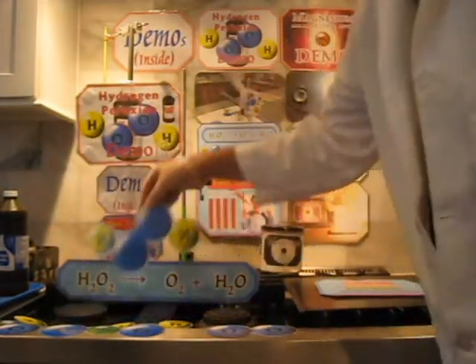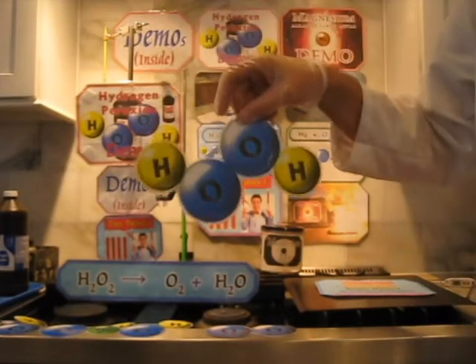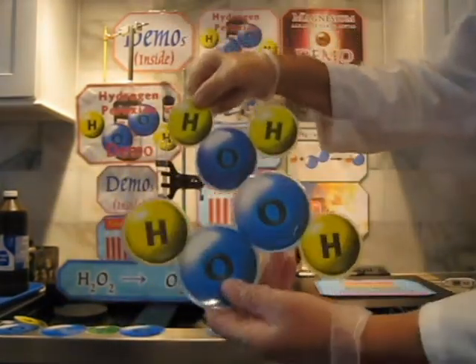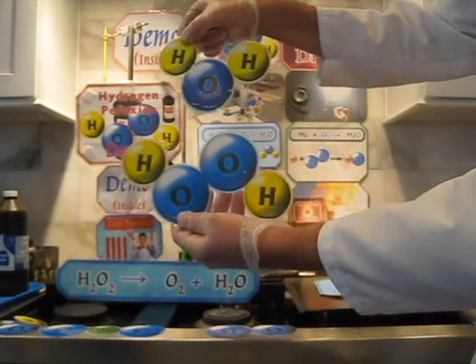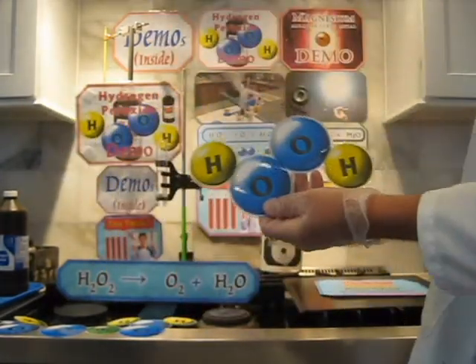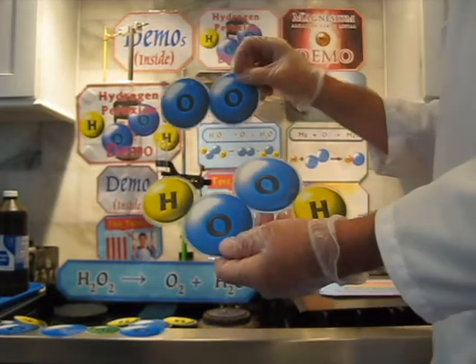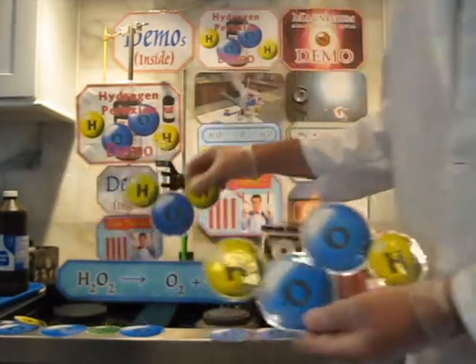Hydrogen peroxide is a funny chemical. H2O2, kind of a funny looking chemical. Kind of looks like it should be this one, right? It should be regular old water. Well, what does it have to lose to become like water? It has to lose one of those oxygens. So if it loses an oxygen, well, then the oxygen flies away. Well, oxygen has to be like this, actually, O2, right? Oxygen has to be like this. And what we are left behind with is water.